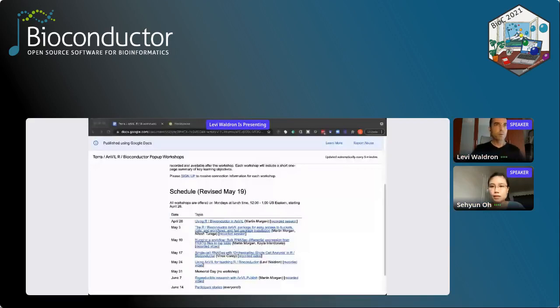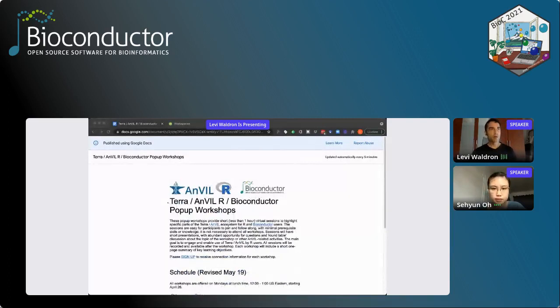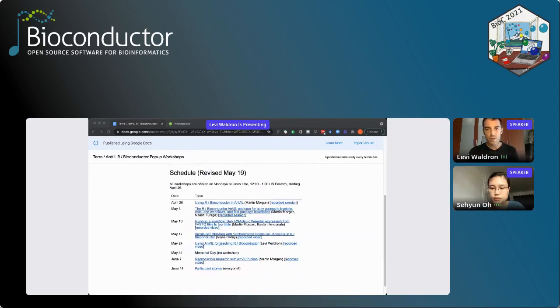All right, so if Sehyun showed you the link to get to this page from her, I think it was waldronlab.io/AnVILWorkshop, and one of the articles takes you to here, which was this series of pop-up workshops that were done by different members of the Bioconductor team on the AnVIL project. So I just wanted to point out here, there's a whole series of these. There's an introduction from Martin Morgan. Martin Morgan did a lot of these, and people in his lab, Nitesh and Kayla.